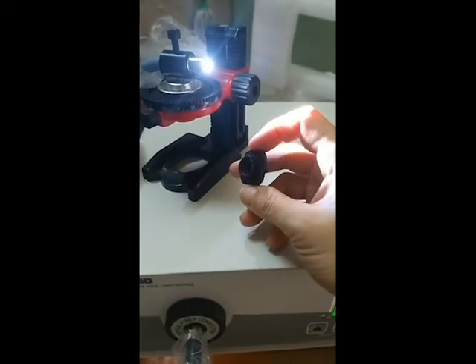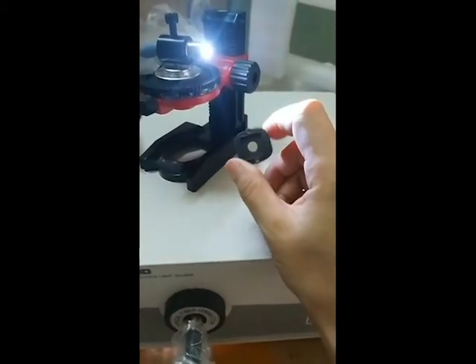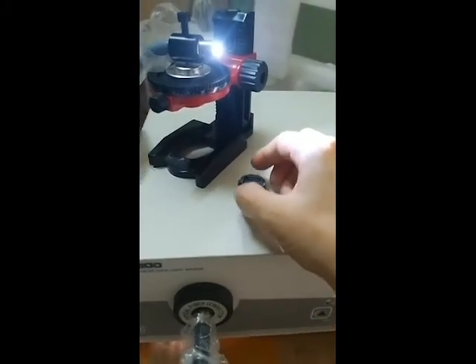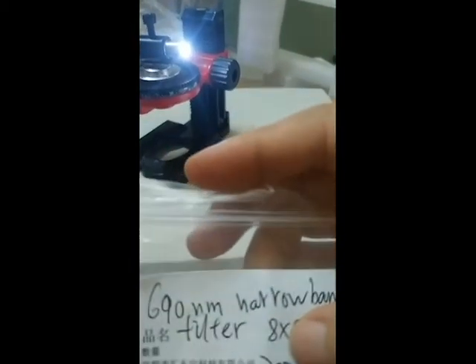Coming together with the light, there are several single wavelengths, narrow optical filters. You can use the filter to obtain the desired wavelengths as listed on the label.